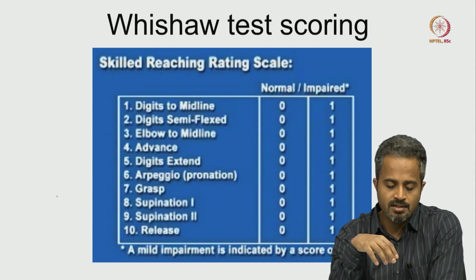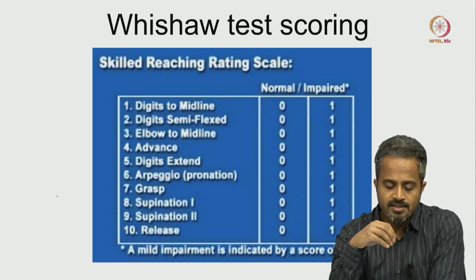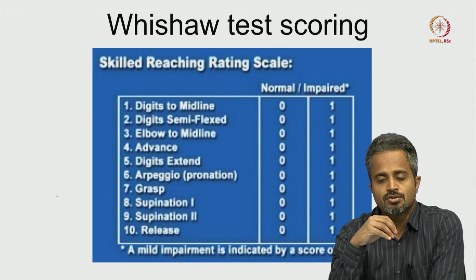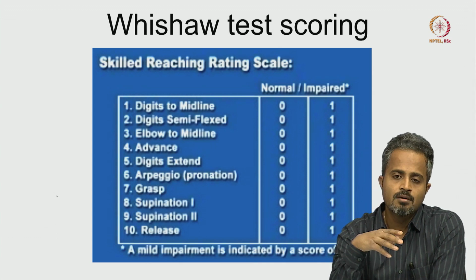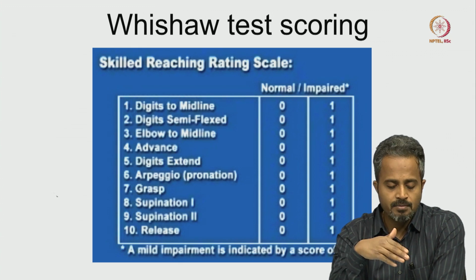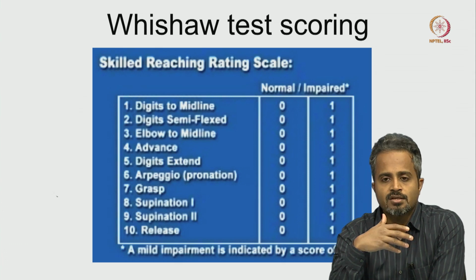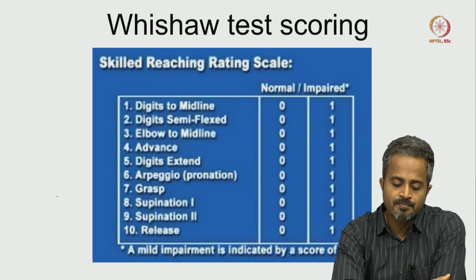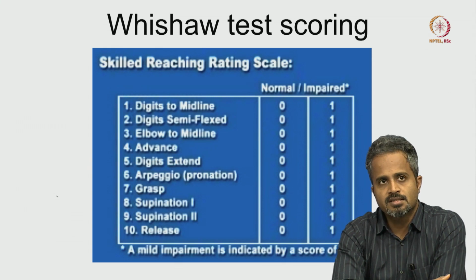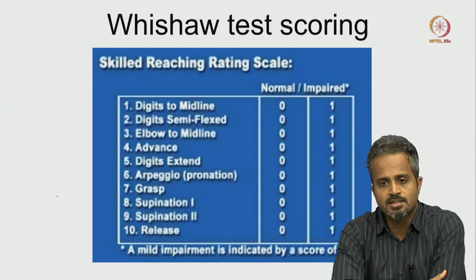And that is when this kind of objective rating comes into the picture. All right. So every single step should be recorded and compared with your pre-stroke behavioral training videos, to see if there are any subtle differences among these 10 different steps. So it's basically a more objective way of looking at the behavioral test, rather than estimating the behavior just by visual inspection.